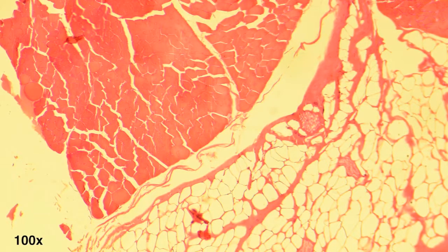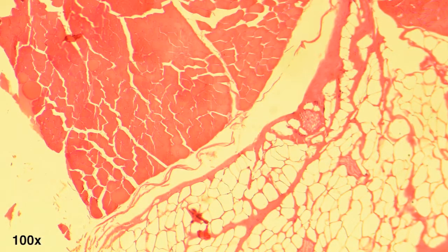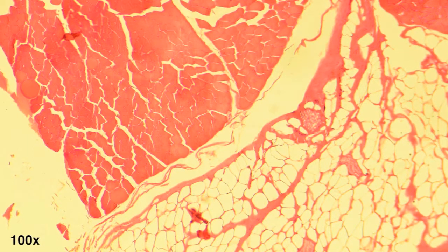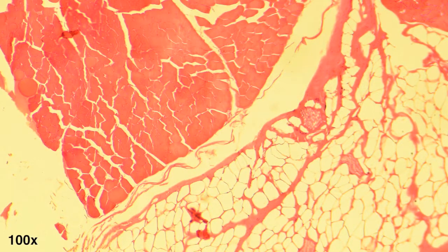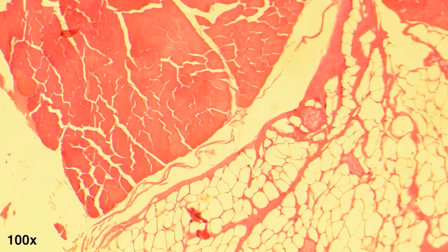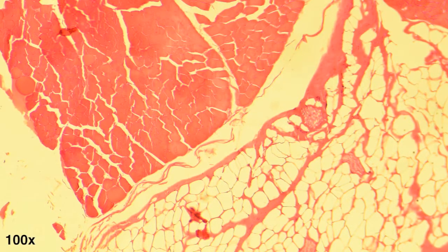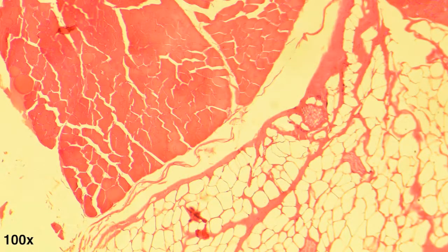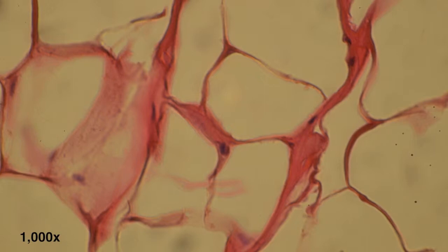First, let's look at raw. Here we are looking at a transverse or horizontal section through the muscle bundle that was the steak. At the top left, you see cross sections of the muscle fibers. Notice the white space between these fibers, which shows where intercellular fluid — mostly water — would be found. At the bottom right, you see the intact adipocytes, which are large connective tissue cells filled with fats. A close-up shows normal adipocyte structure.